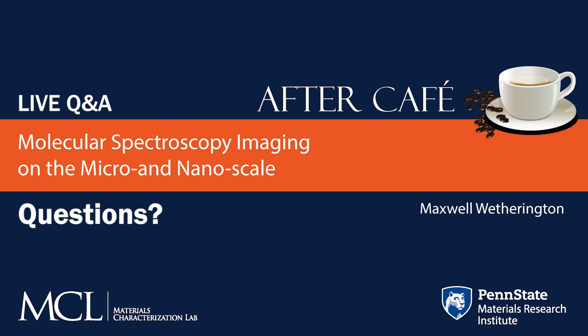And there are databases out there for all sorts of minerals, pigments, polymers. There's a wealth of data that exists out there. We also have access to one of those libraries. It is not completely comprehensive, and it's quite honestly a challenge to have something that is comprehensive.